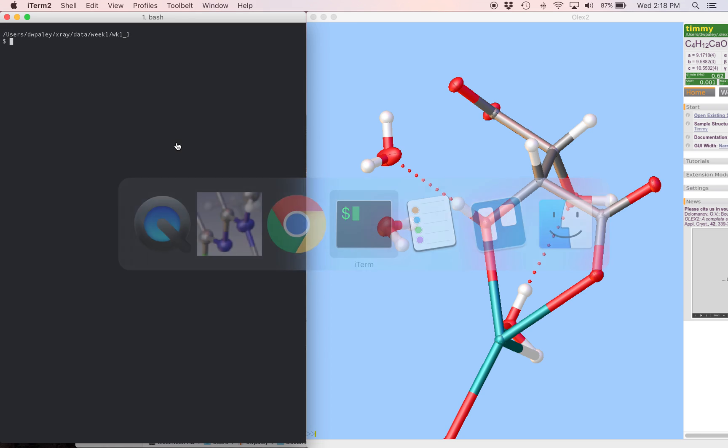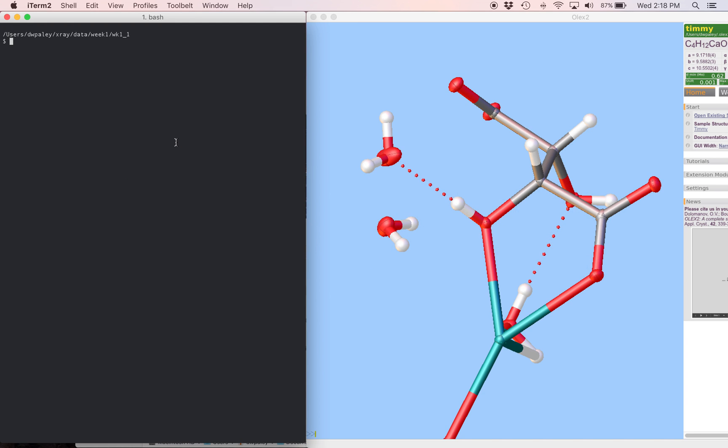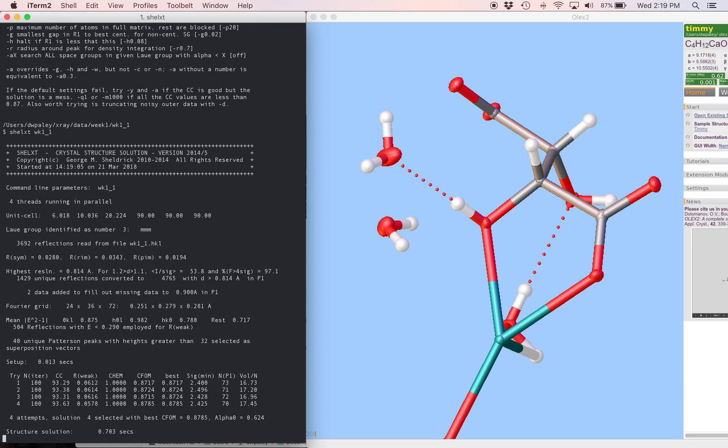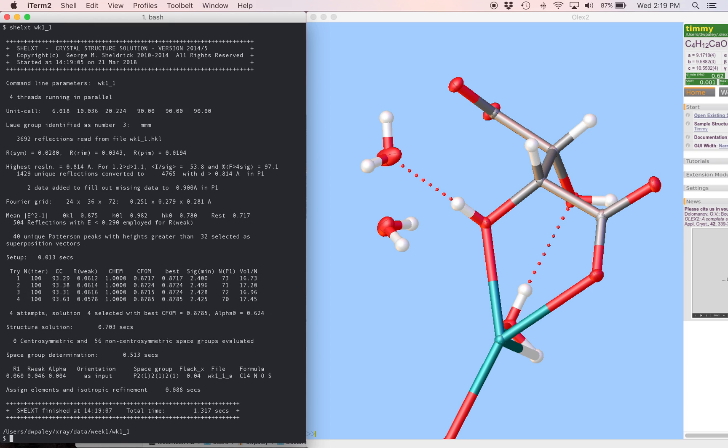I'm going to start by going to the directory that our ins and hkl files are in, and I'm going to solve this with ShellXT instead of ShellXS. I better give the file name. ShellXT runs pretty quickly.